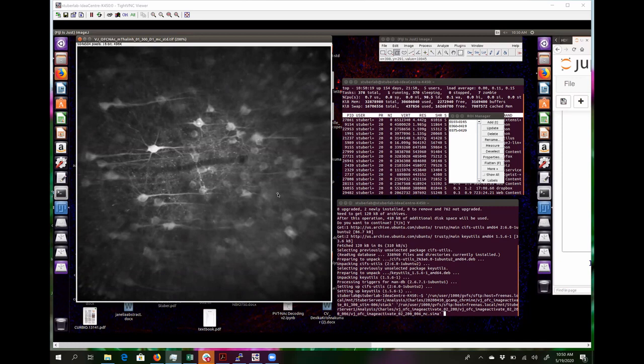That means not drawing on other processes, and not drawing where there's overlap with another cell. Number two is, as long as you have a minimum number of pixels, to generally draw smaller ROIs to account for motion, and also any overlap. Yeah, that's true.